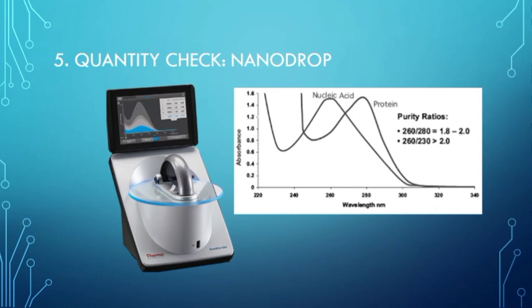Somewhere our friends are doing DNA extraction of fungus, and we see that they have 3 to 6 nanograms of DNA per microliter. In plants we generally get about 300 or 400 nanograms per microliter, or sometimes more than 2000 nanograms per microliter.